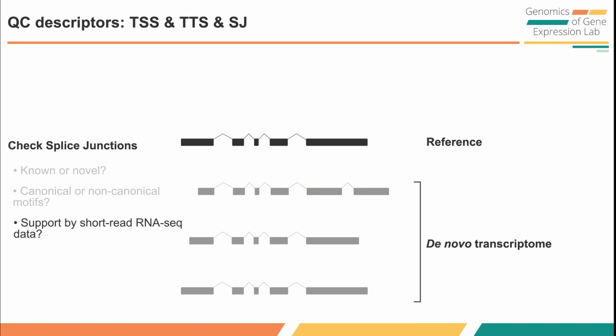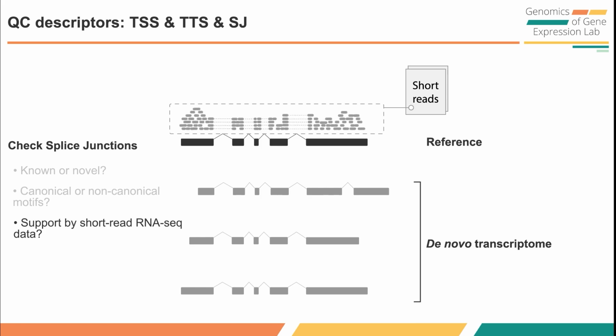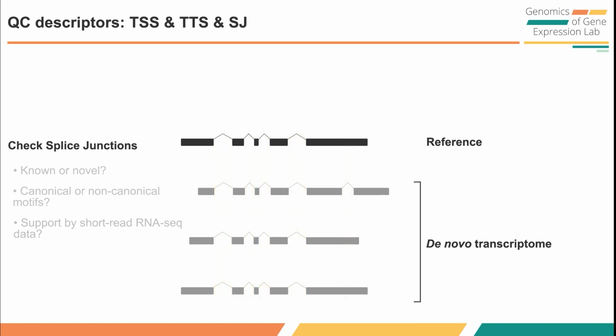If you have short-read data, you can run STAR to get the junction file and supply it to SQANTI3, introduced in the SQANTI3 quality control input part. Short-read coverage across junctions represents an informative measure for quality control of sequenced transcripts, and SQANTI3 finds whether short reads support the junction.